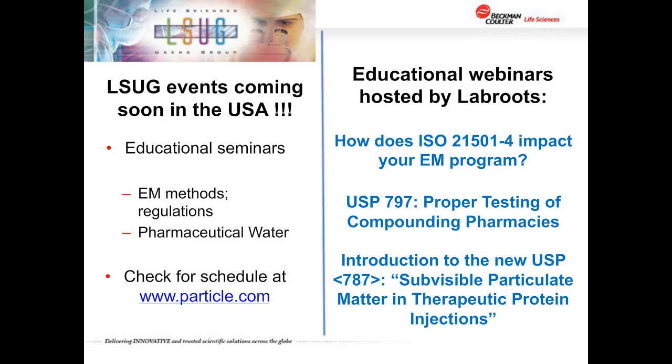Okay. Next, we have a question from Dominique who says, what tests have to be performed during calibration? Okay. And I'm going to guess this is probably looking at 21501-4 in particular. And again, there's a difference between what's done in production or initial design versus what's done in the field, because some tests, doing them in the field, are limited.